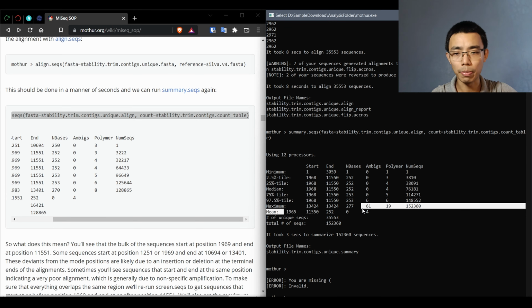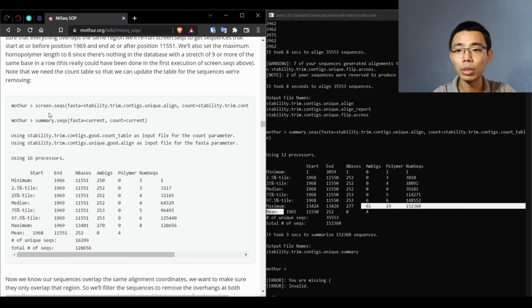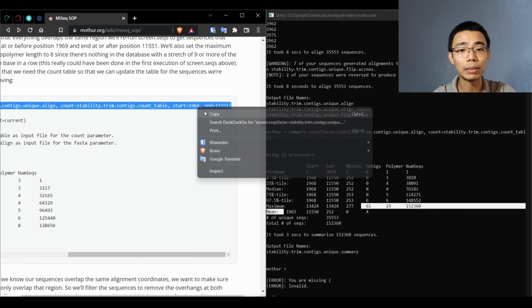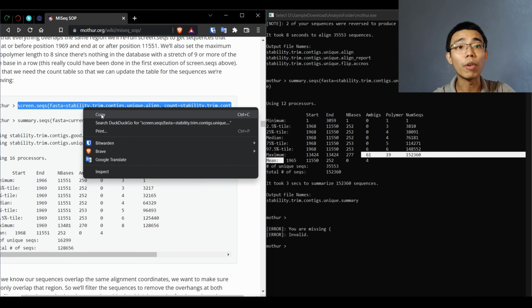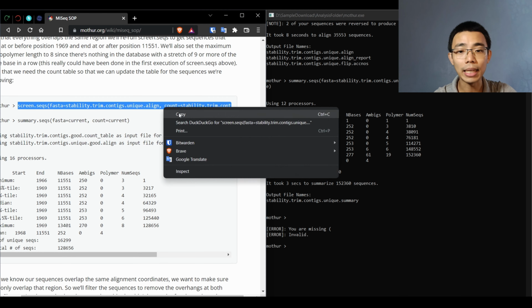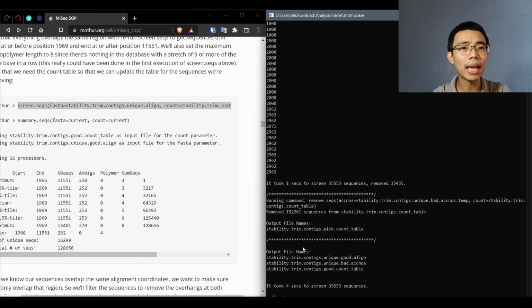So we also want to remove those outliers. We don't know whether they are wrong or right, but we usually do not want to consider them as part of our analysis since we don't really understand them and we don't know where they come from. They might be important, but in this case, it's usually recommended to just remove them. There could be some sequencing error, it could be some environmental contamination, it could just be like a cosmic ray hitting a computer, resulting in some wrong sequence.